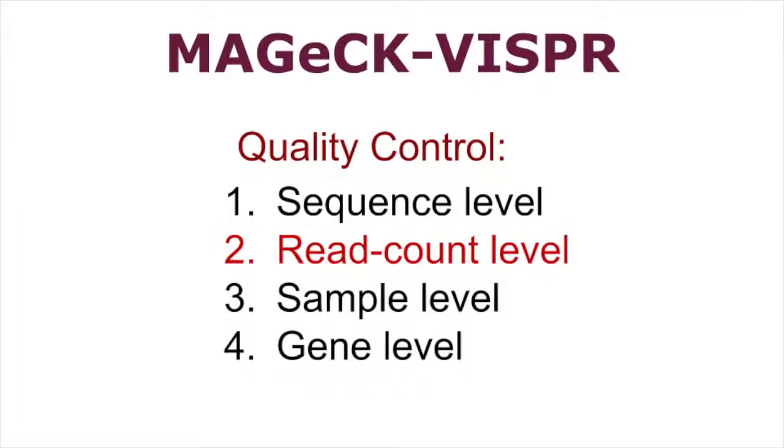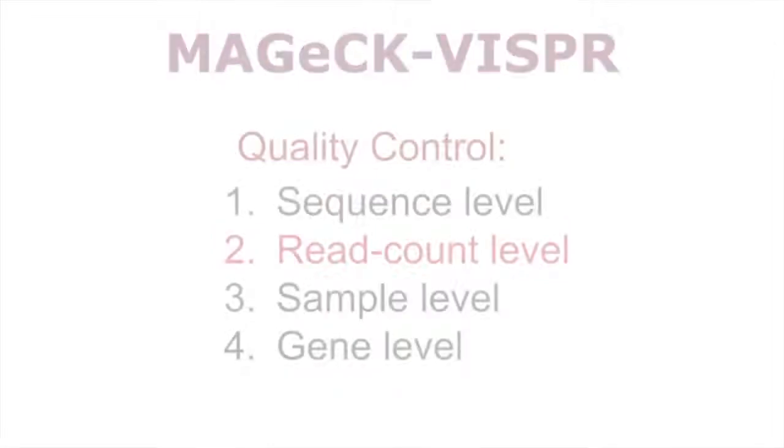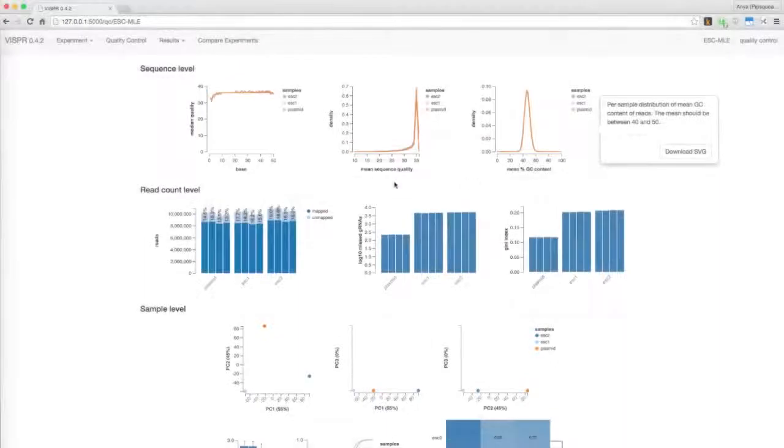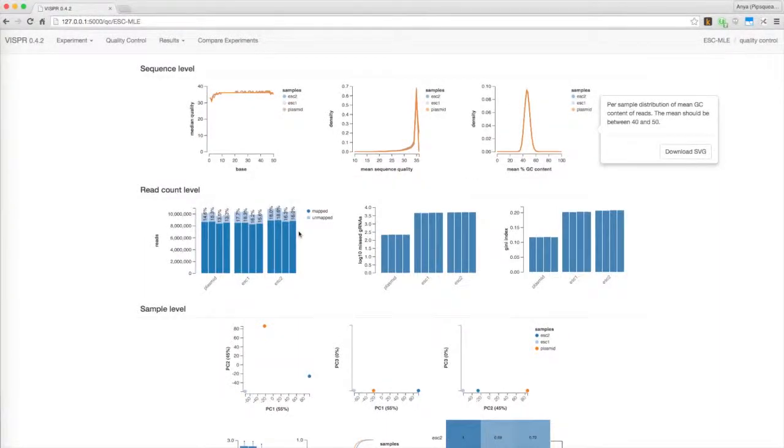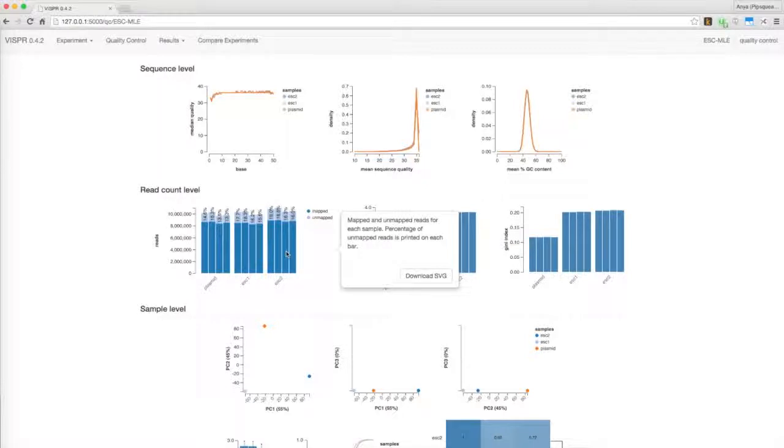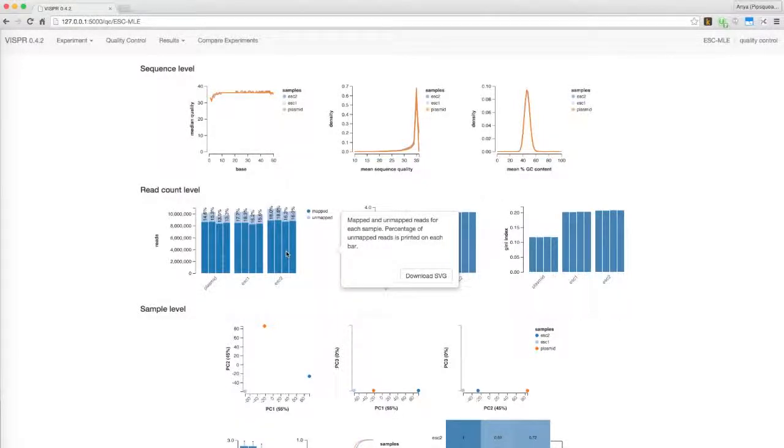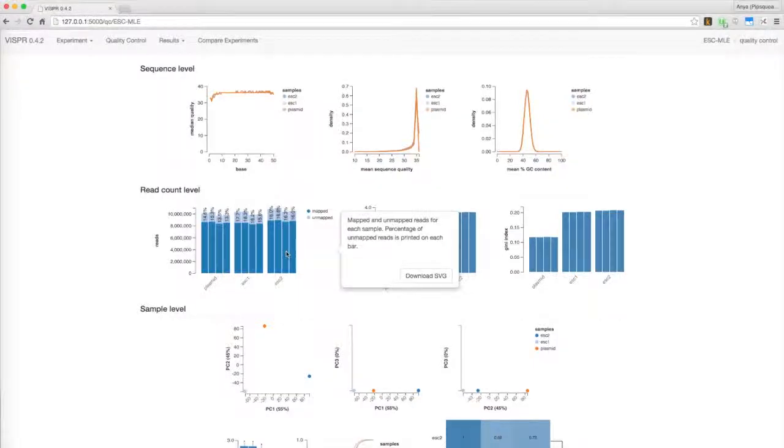The second level of quality control measurements is based on the sgRNA read counts collected from MAGIC. MAGIC maps raw sequencing reads to sgRNA sequences in the library. This graph shows the relative percentages of mapped and unmapped reads. A high percentage of unmapped reads can indicate sequencing error, low library quality, or other quality issues.